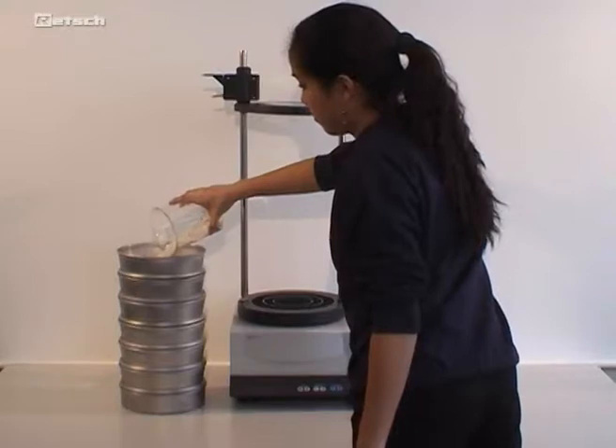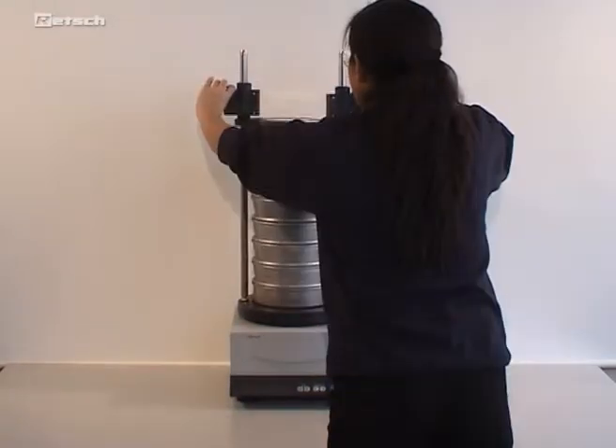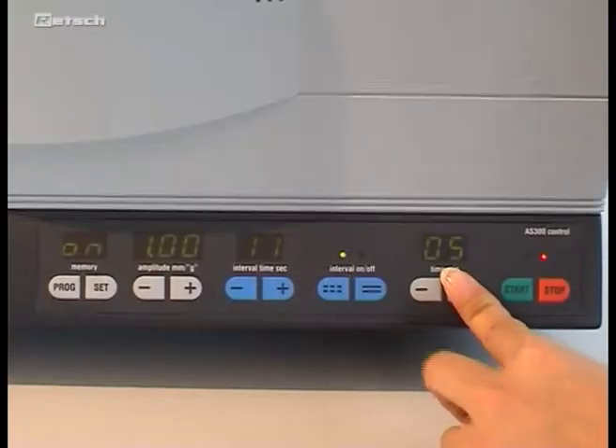All that has to be done is to pour in the sample, put the sieve stack into the shaker, close the clamping device, enter the required parameters, and start the sieving process.